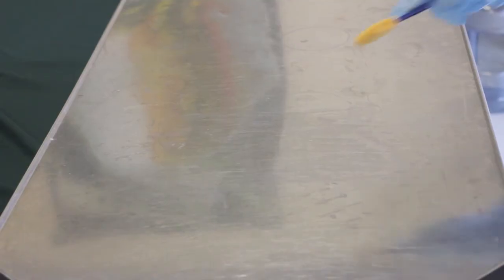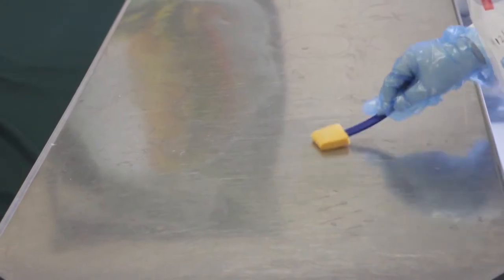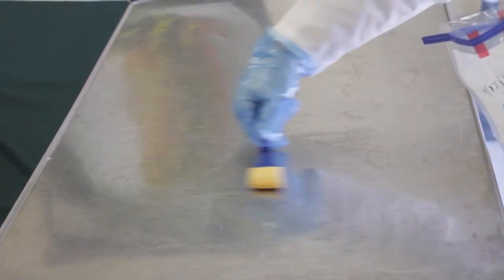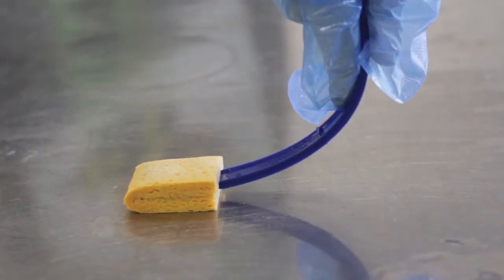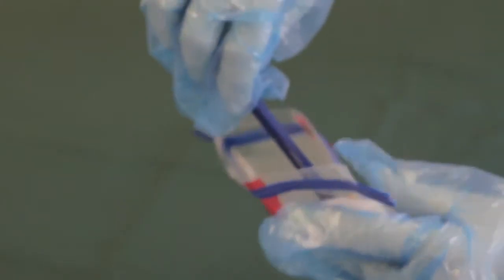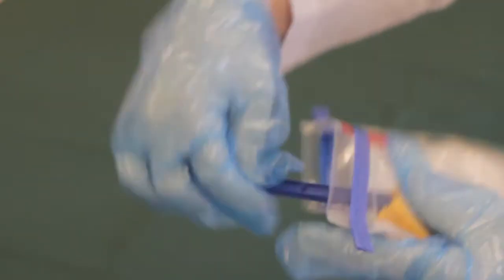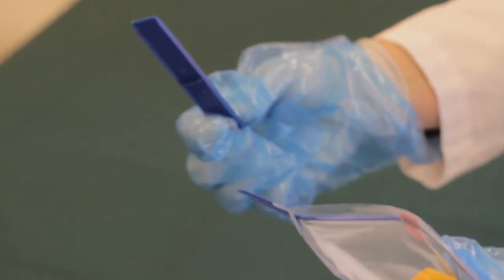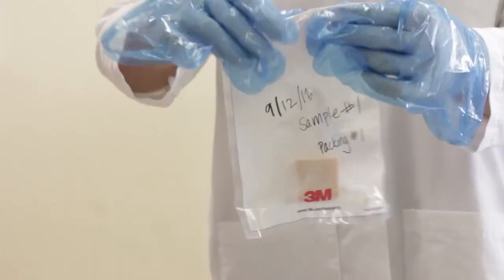On large and flat surfaces, swab a 4x4 or 12x12 inch area using a crosshatch pattern. Apply heavy pressure when swabbing to ensure that the sponge is picking up the sample from the environmental surface. After swabbing, return the sponge to the bag and bend the stick until it breaks off. Close the bag by rolling the top and folding over the tabs.